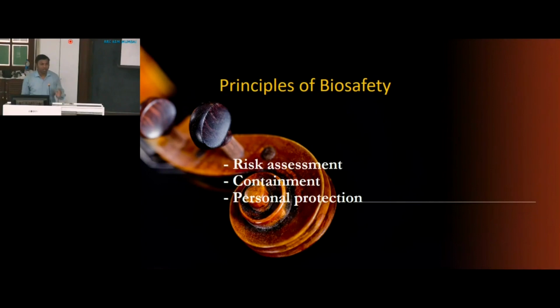Containment means not allowing the pathogen to spread. Like the biomedical waste we learned yesterday, even your reduction of aerosols. There are some procedures by which you can reduce the aerosols. And personal protection. So what is in your hand is mainly the personal protection, which I taught you during PPE, donning and doffing. So you need to know how to use it properly.